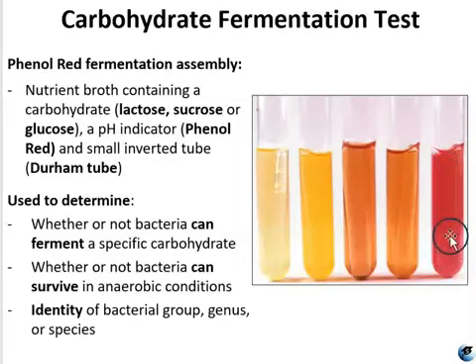And you ask, well, what's happening here? Is this a negative test? No, this is not a test. This is a negative control. So you would have a negative control tube for any of your fermentation tests or any of your phenol red fermentation tests so that you can compare the negative to the test. Because if I didn't have the control tube here, I might say that these two are negative because they look much redder than these, but in fact they're not red at all.